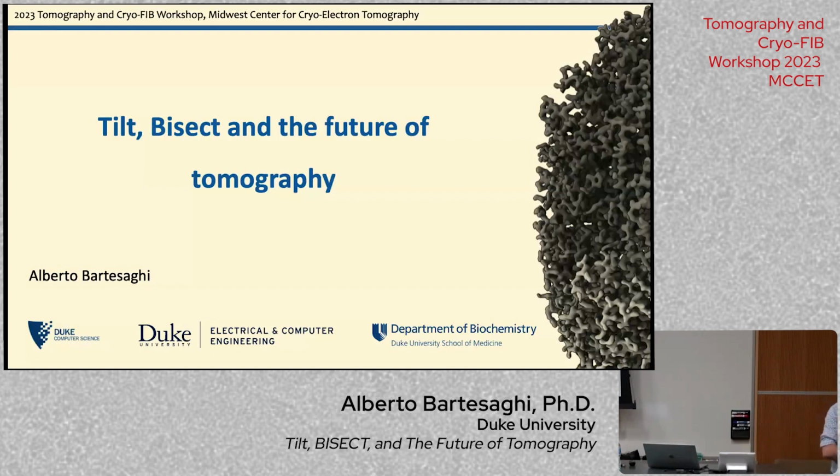But that's exactly what I wanted to illustrate. What's really exciting about tomography is these days you can't really tell whether it was done using single particle cryo-EM or tomography. This particular one was done with single particle because I was lazy. I didn't want to update that, but I'm going to show you something very similar that was done with tomography. But I think that just goes to show how far tomography has come, and in particular the resolutions that can be achieved today are something we didn't even think would be possible a few years ago.